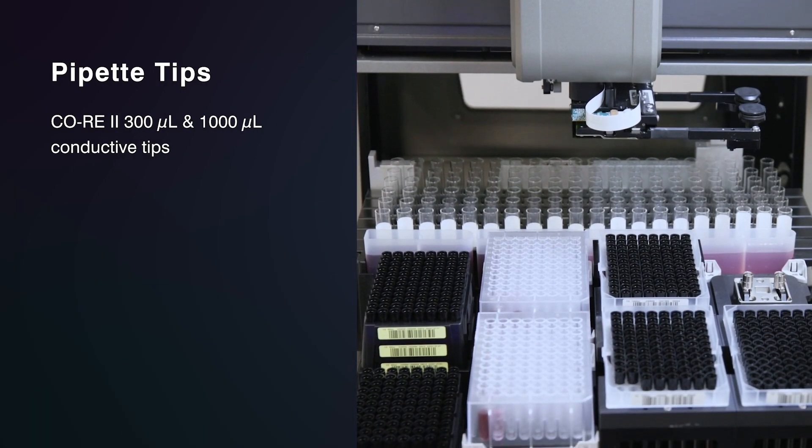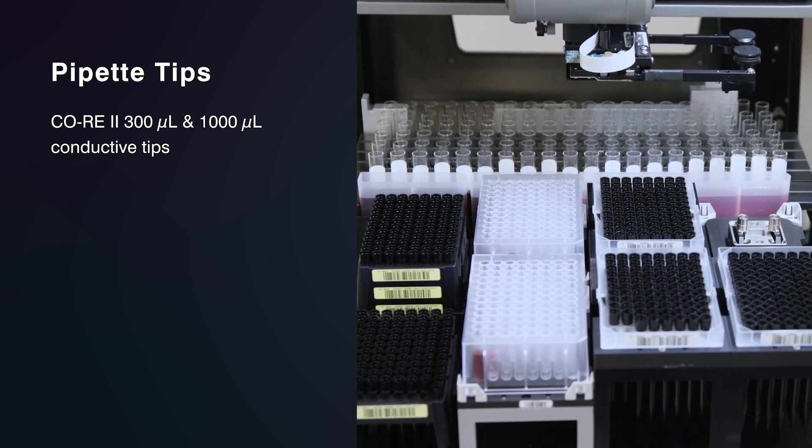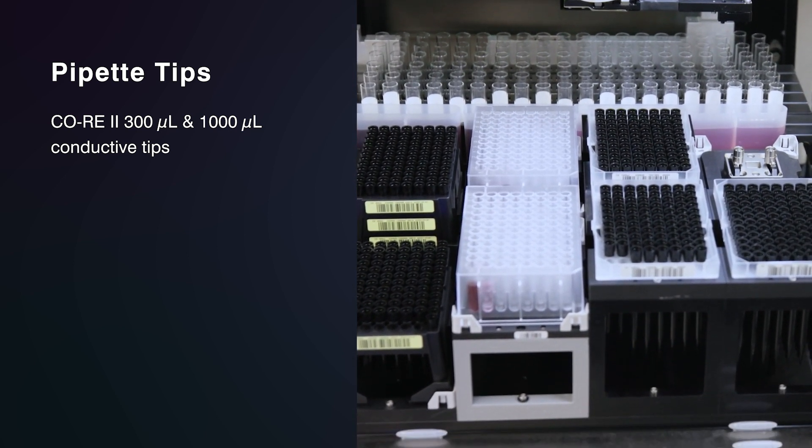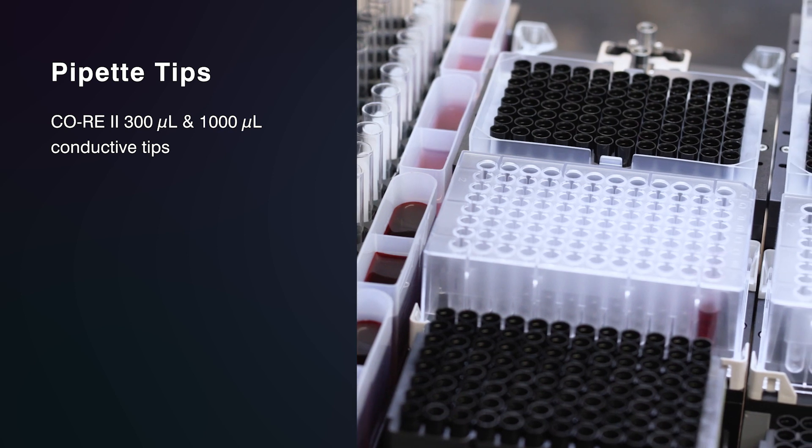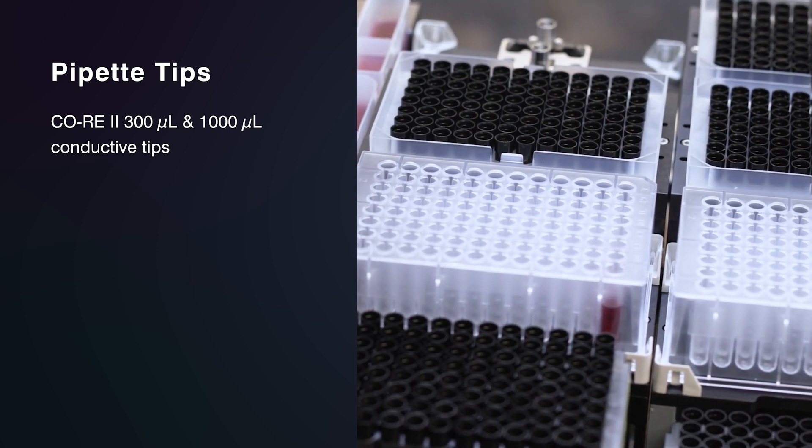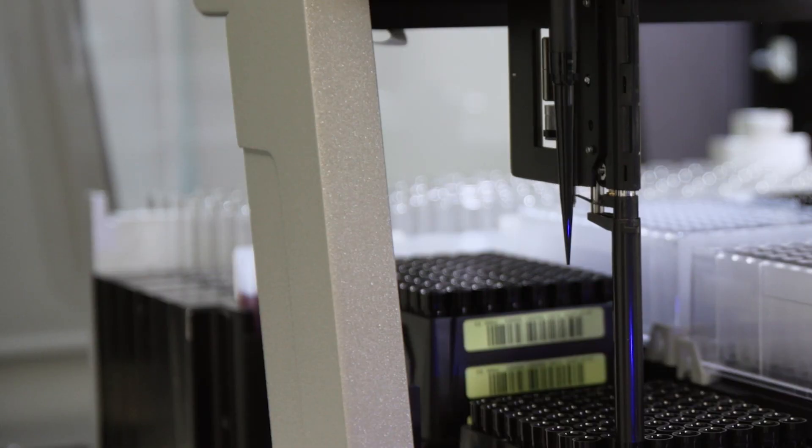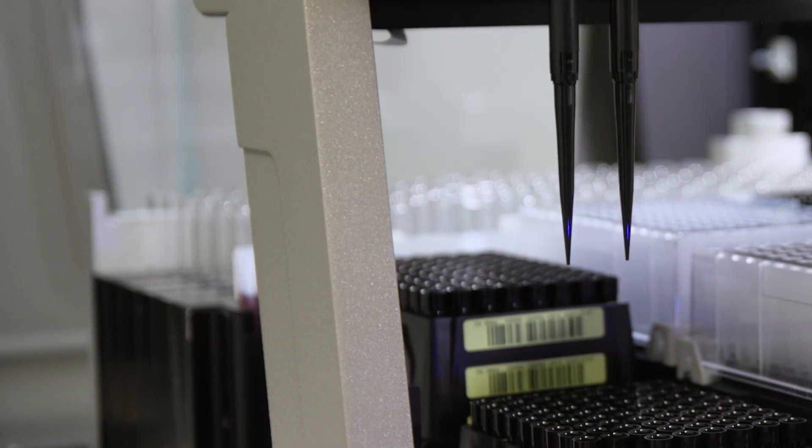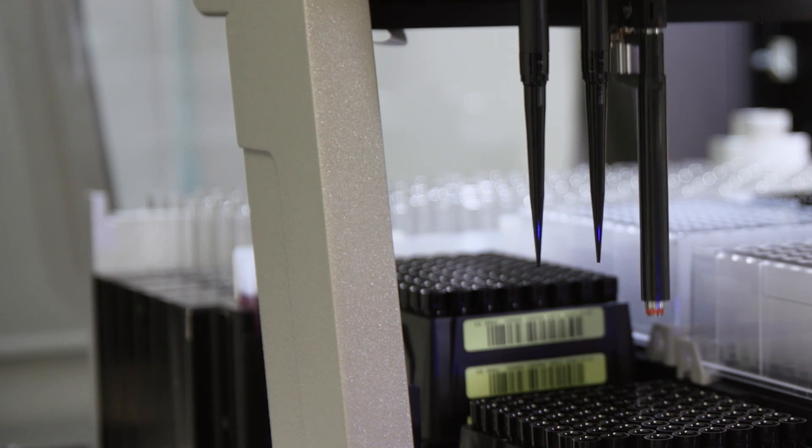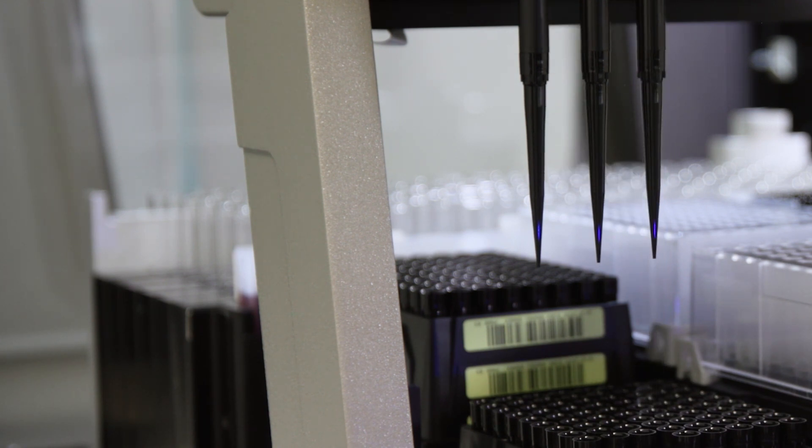There are two pedestals that hold the pipette tips on the deck. The first tip pedestal holds 300 microliter tips for sample movement and the second holds 1000 microliter tips for diluent, dilutions, and mixing. These Core 2 conductive tips are specifically validated for use with the Nexus 200 system, which consistently delivers precision, accuracy, and reproducibility during liquid handling.